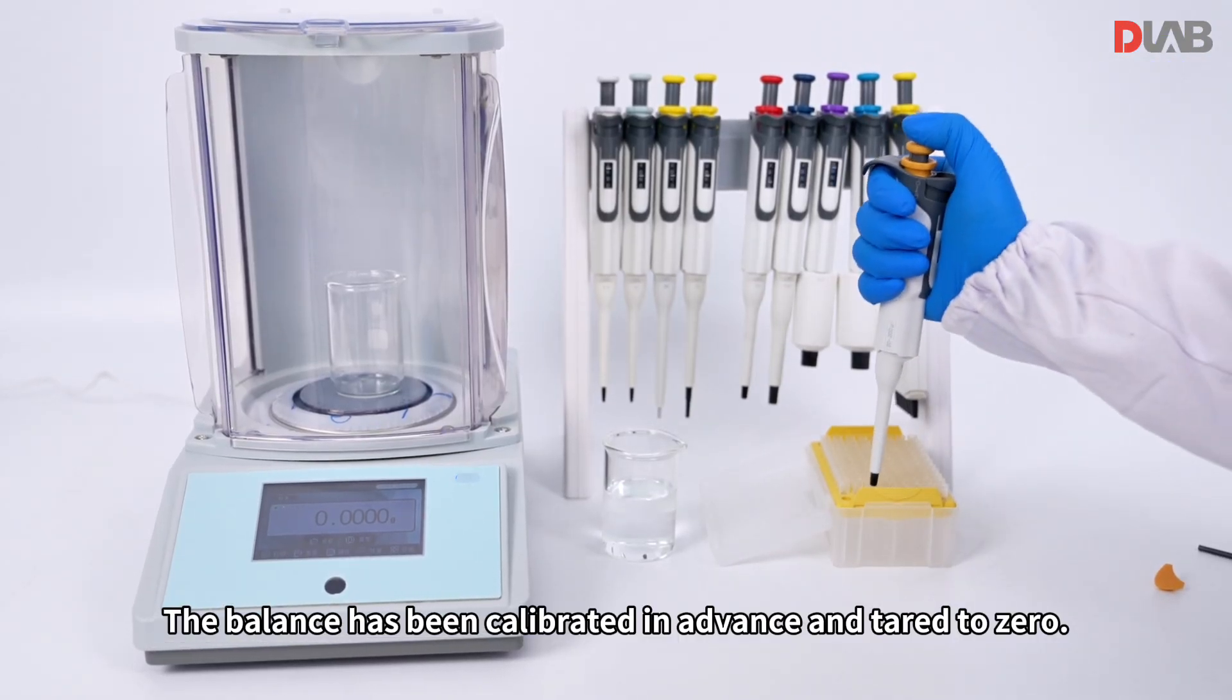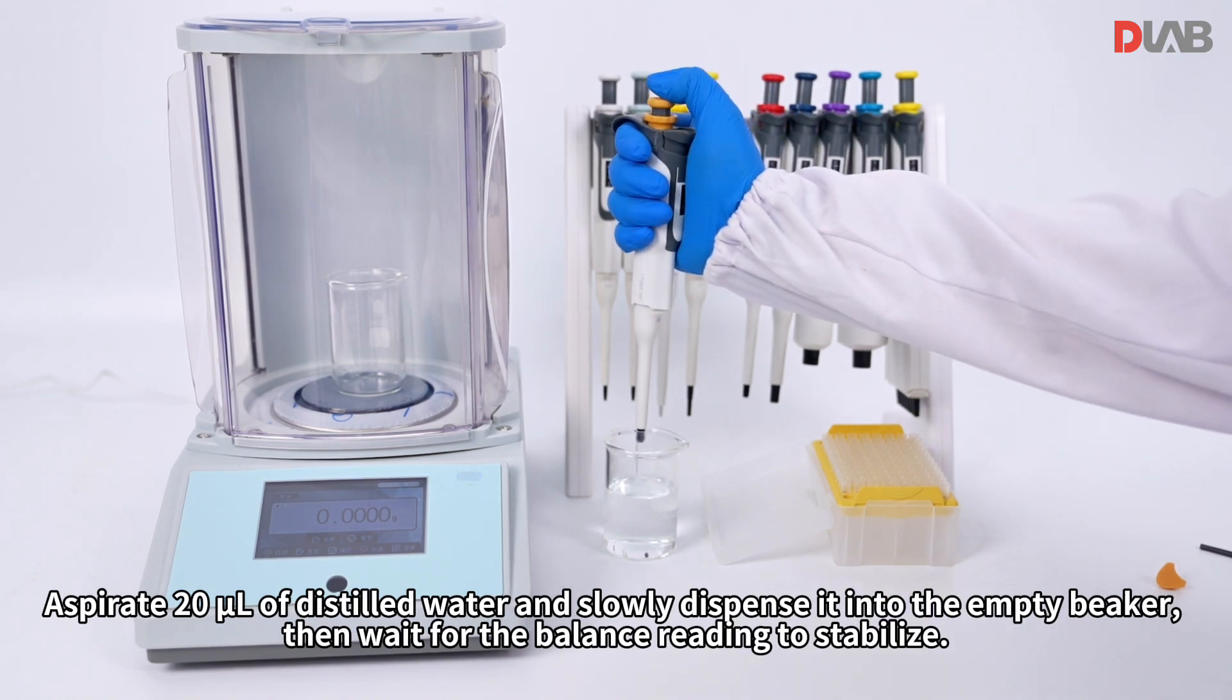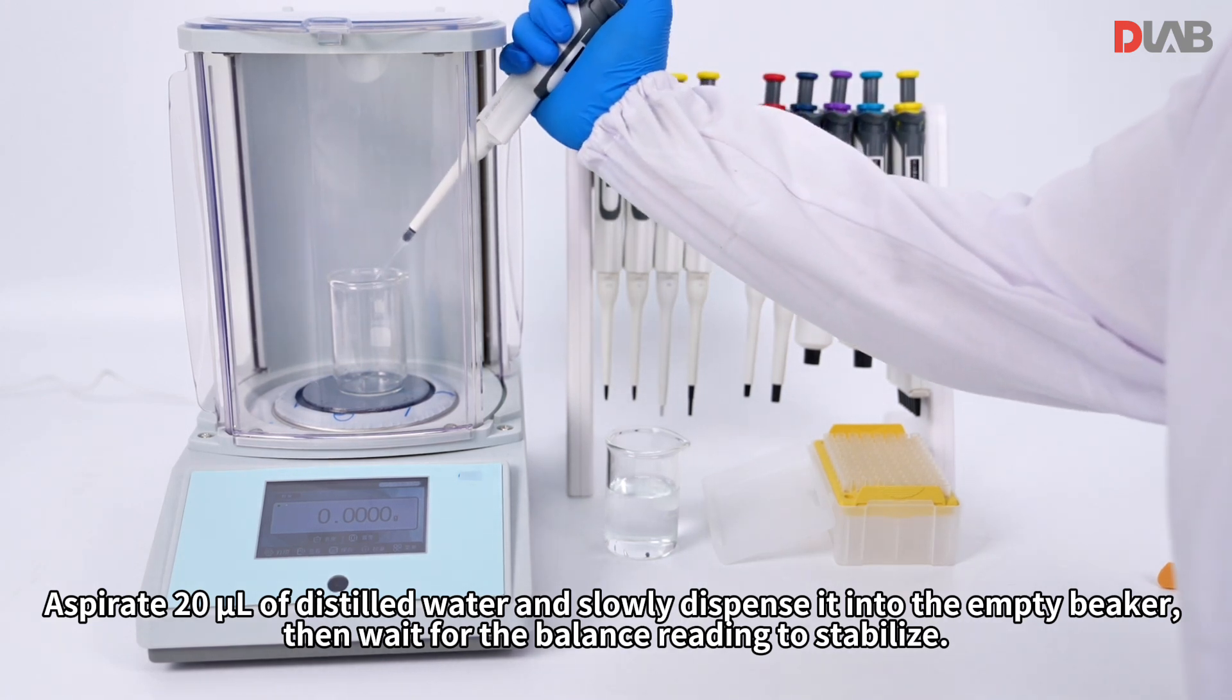The balance has been calibrated in advance and tared to zero. Aspirate 20 microliter of distilled water and slowly dispense it into the empty beaker, then wait for the balance reading to stabilize.